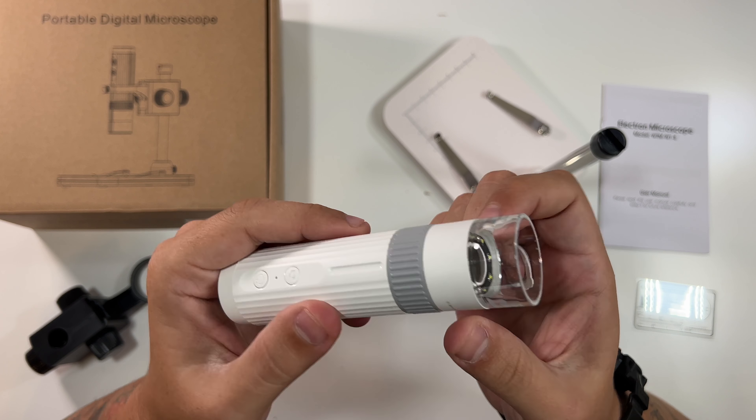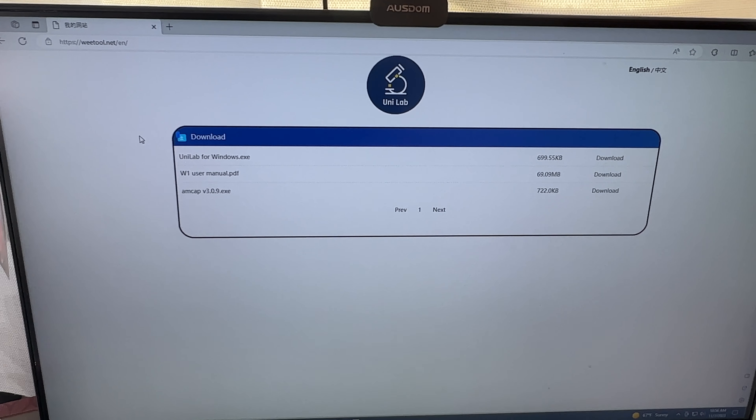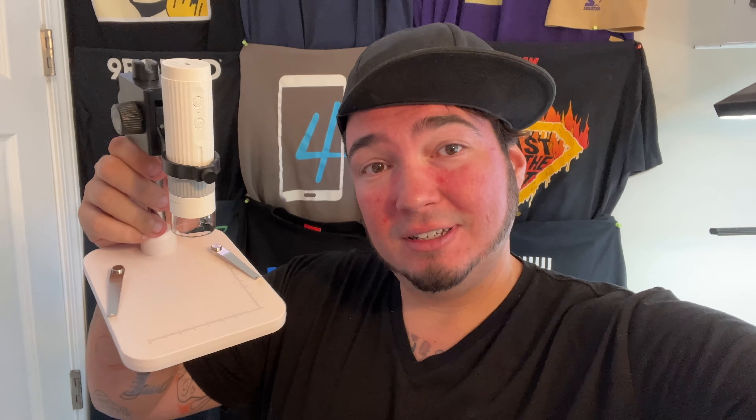The camera itself also has a photo button you can set up to work within the software. Back here are brightness settings — one direction for brighter, the other for less bright, depending on what you need for the item. On Windows it works about the same way: you download the tool from their website, plug it in, and use it similarly — except through their software rather than Photobooth.